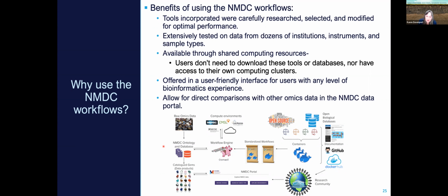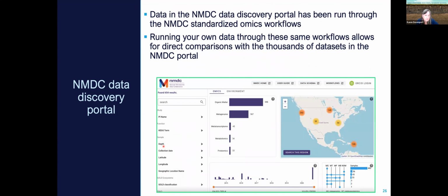It also allows for direct comparisons with other omics data sets, because all of the data in the NMDC data portal has been put through these NMDC omics workflows. And this is the NMDC data portal, which I think you learned about yesterday, and you can find other data sets that might be related to yours that might be an interesting comparison to your own.